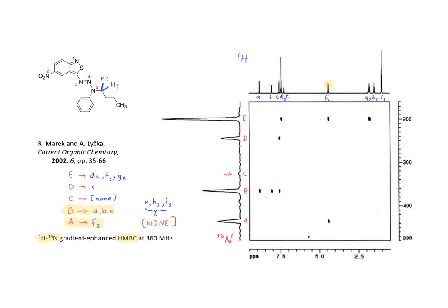I know it's difficult to see here, but A is an apparent singlet. B and C look like doublets. And so that's consistent with protons attached to the nitro-substituted benzene ring. So now we've assigned the nitro group as nitrogen B.